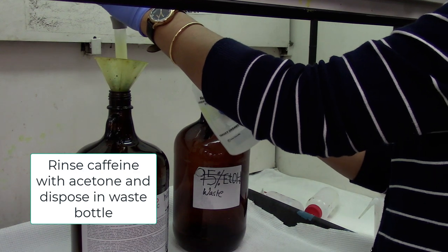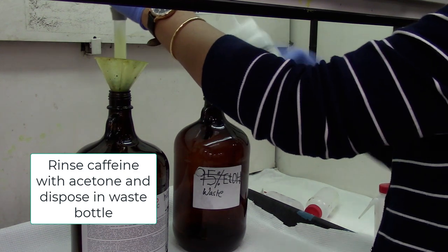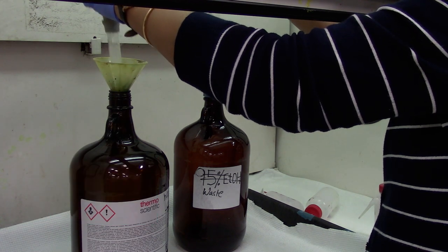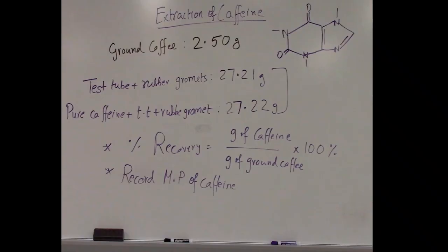Scrape some caffeine into a watch glass and record a melting point. Once done, rinse the caffeine into the waste bottle with some acetone and using the data find the percent recovery of caffeine. Thank you.